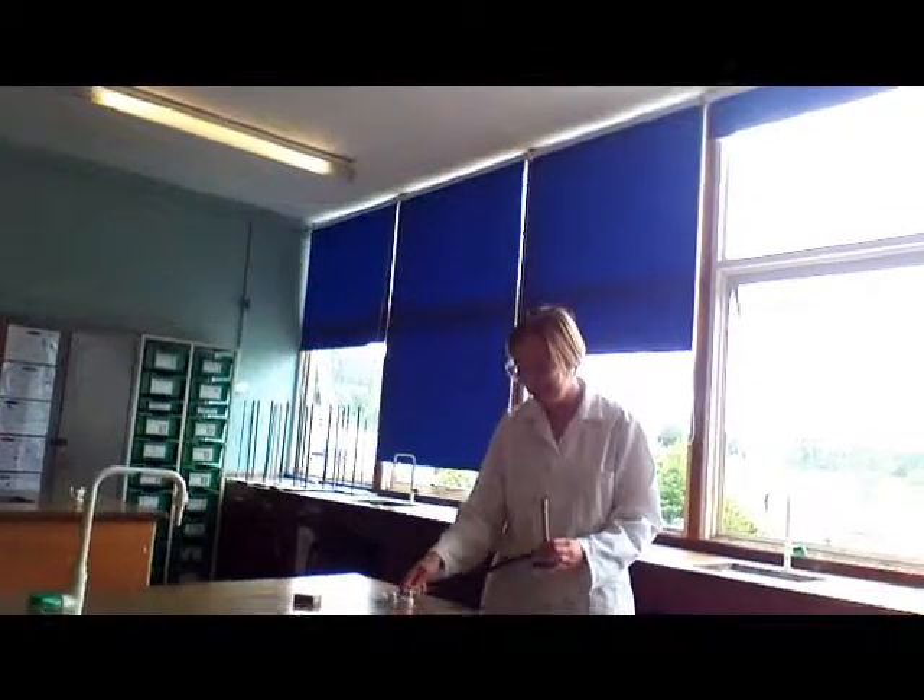How to light a Bunsen burner. Take the hose and attach it to a gas tap. Make sure that the air hole on the Bunsen burner is closed.